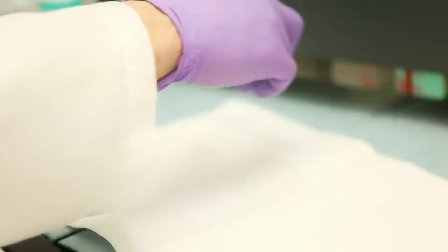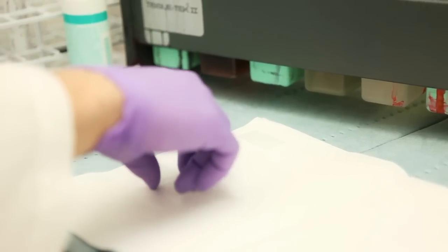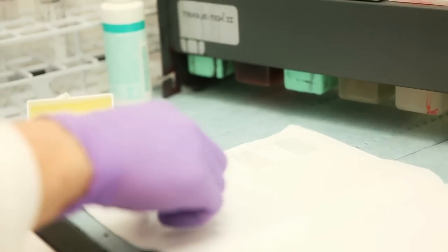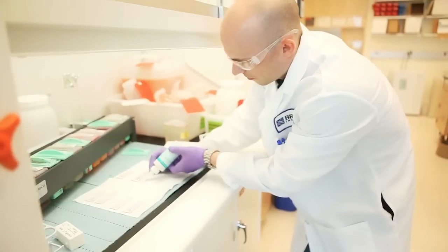These lung cancer samples are just beginning their journey through the Broad, where they will be carefully analyzed and possibly sequenced in full. Clint's hands are two of the first through which they pass.